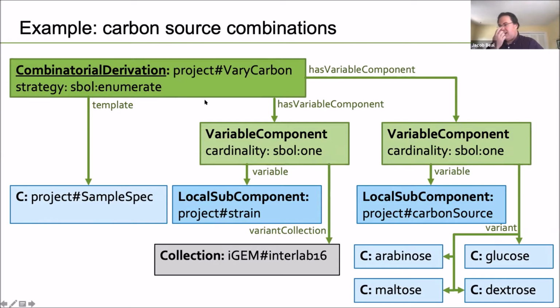In this particular case, we're going to test all the combinations, and we're going to put precisely 1 of each. You can also have things that are optional, so 0 or 1, you can have things where you put in combinations. And you can also, rather than doing everything, you can do sampling. Like, again, in the machine learning example in the keynote, to describe that experiment, we would use a sampling strategy rather than an enumeration strategy and draw however many samples they drew.